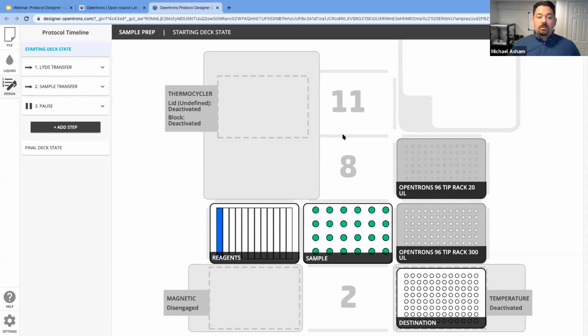Next question is, does your company PM or do preventative maintenance on the instruments periodically to ensure pipetting accuracy? And do you have preventative maintenance protocols in place? Yeah, that's a really great question. Opentrons operates on a customer enablement model where we encourage our customers to take the care and maintenance of the instruments into their own hands.